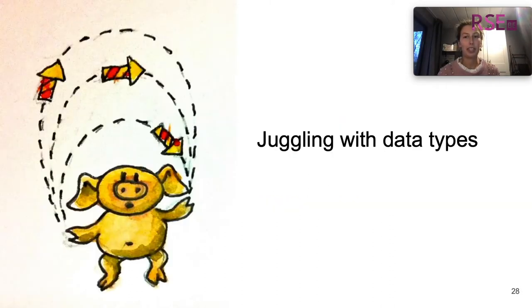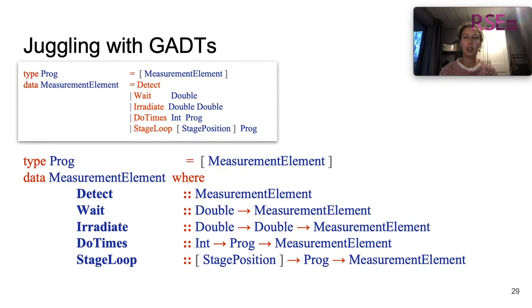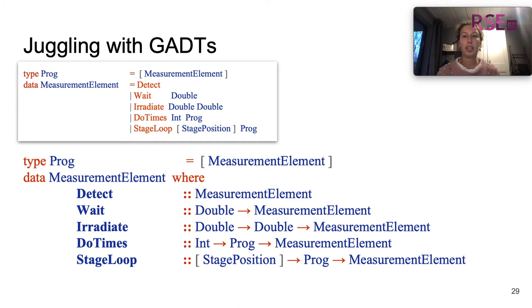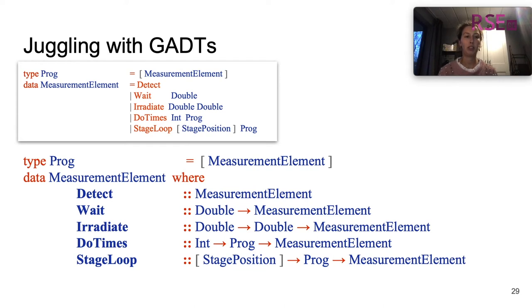Let us now do some more technical stuff — we can start juggling with the data types. Starting from the deep embedding we defined before, we had a type constructor for each term in the DSL. We can encode these measurement elements as a Generalized Algebraic Data Type, or GADT. Programs remain the same. We still have detect, wait, irradiate, do-times, and stage-loop — just the form of implementation is different. We use a GADT instead of a simple data type.